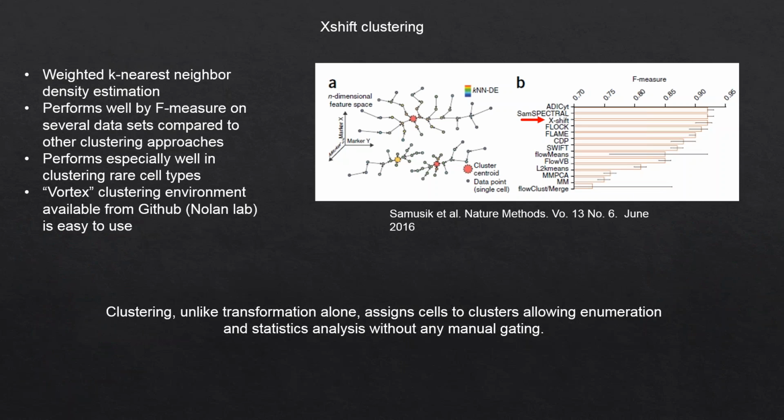And then just quickly, I'll say that we also use some clustering, because what tSNE or PCA doesn't do is assign an object or a cell to a group. So tSNE is very useful for data exploration. You can have a look: do you have some cell types or events that are clustering together in a population? You can get into FCS Express and gate on those directly, just using DAF files, and make some data grids with images to actually have a look at them and drag your gate around and explore the data. So it's very useful for display purposes and data exploration.